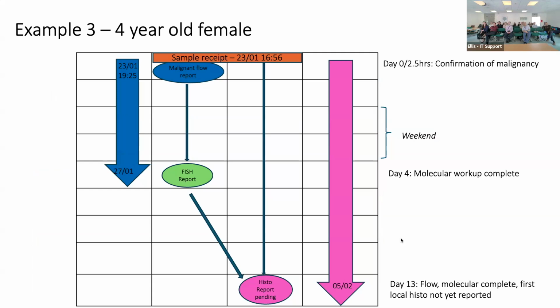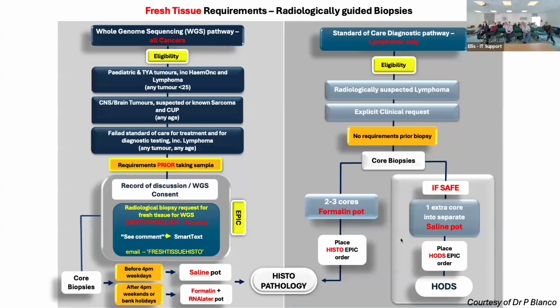And at that point, we still didn't have the histology formalin case to look at. Again, slight cheating because a larger piece of tissue needs slicing and fixing. But the point, I think, is well made that it is useful to have that sample. And quite frankly, if they wanted whole genome sequencing, we could have retained that chunk of tissue and sent it off without needing to bother anyone in histology with that.